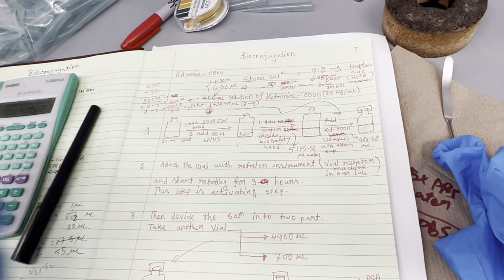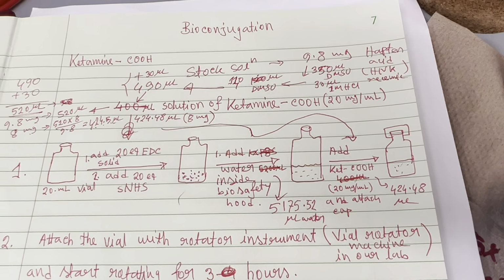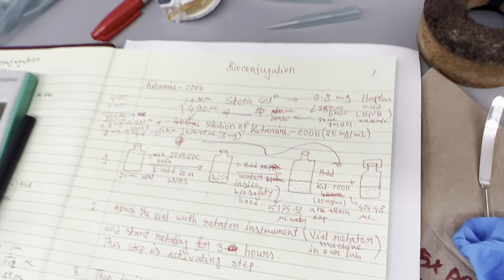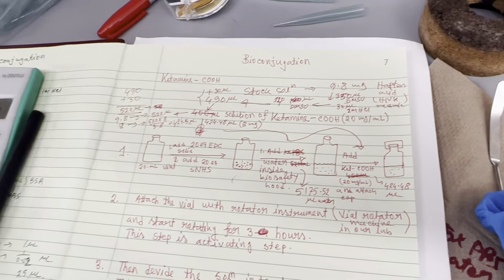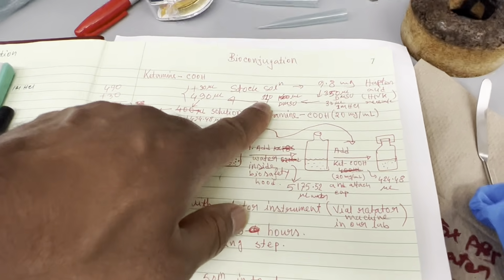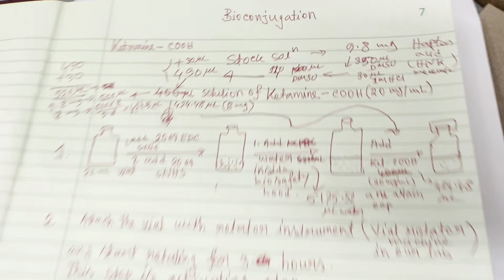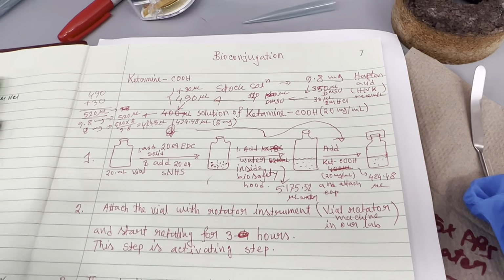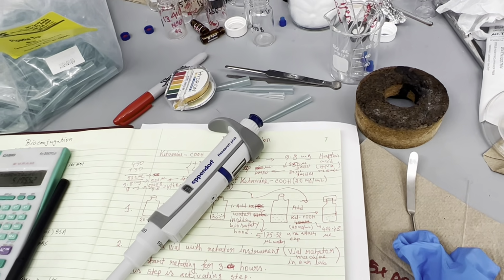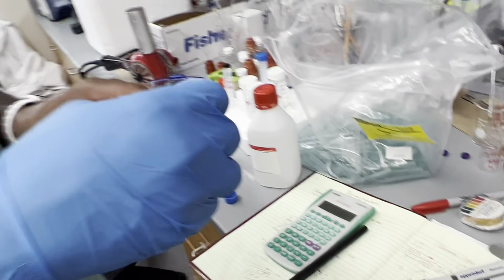So that's what I'm saying, we have to adjust the remaining DMSO. So what is the DMSO we added? We added all of this already. I added 110 also, but here I did 140. So 30 more microliter I have to add. You got it? The amount of the acid we added, that much less we didn't add here.